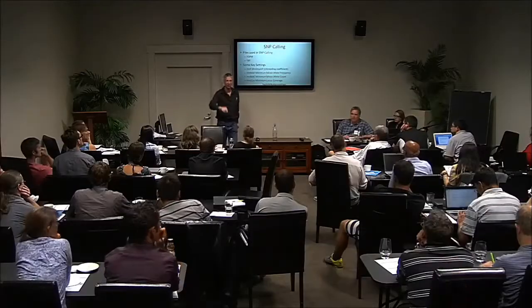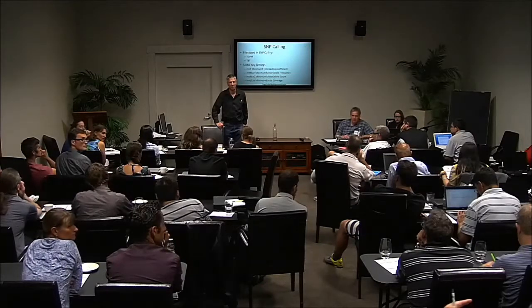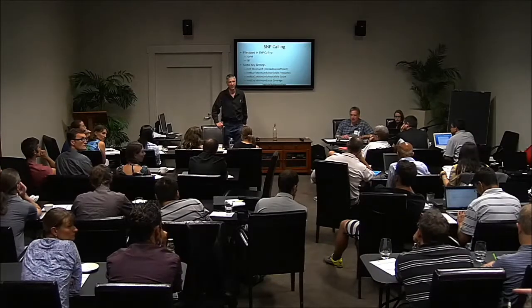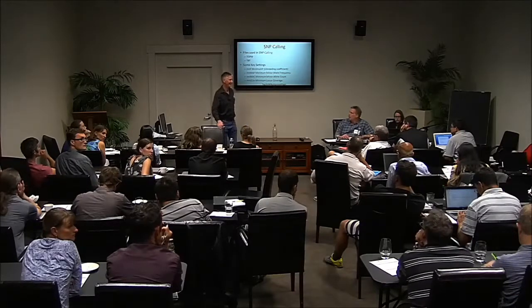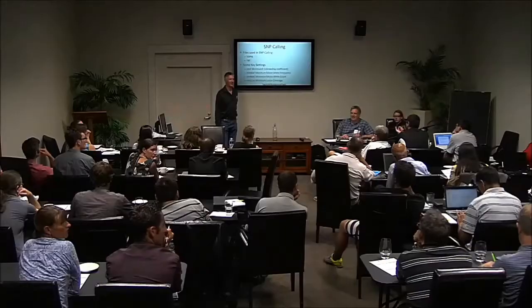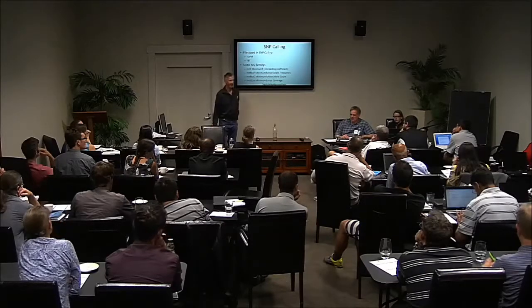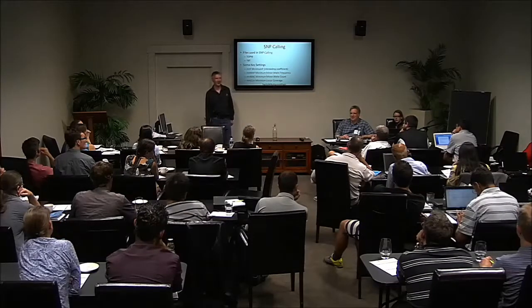Okay. John? There's obviously a little bit of magic in here too, because presumably you can have reads going this direction, reads going in this direction, and they can overlap. Yes, but we define a tag locus as things on the same strand with the same start site. So no, but you could have two tags that effectively pull the same stuff. Yeah, you do get overlapping, but we deal with that at a subsequent step. At a subsequent stage, yeah.